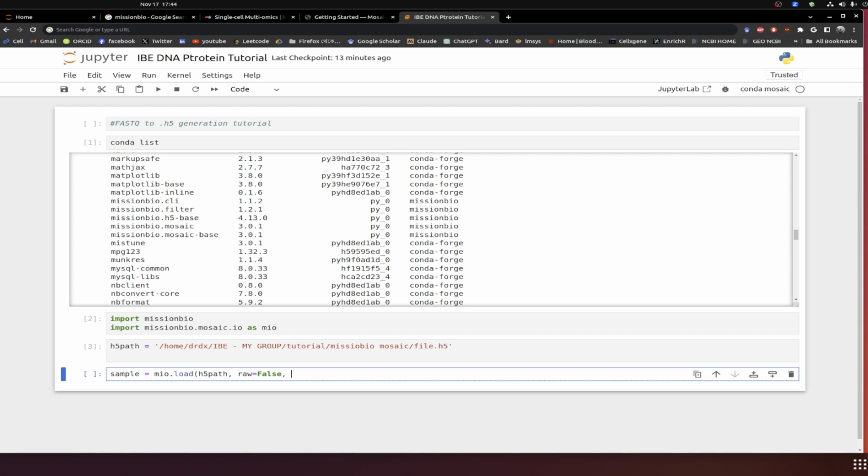So next step is we go for the filter variants. So we go for filter underscore variants. Just keep it careful in here, version to version they change it. So apply filter was the previous version, the current version has this filter variants, and future versions could be different.